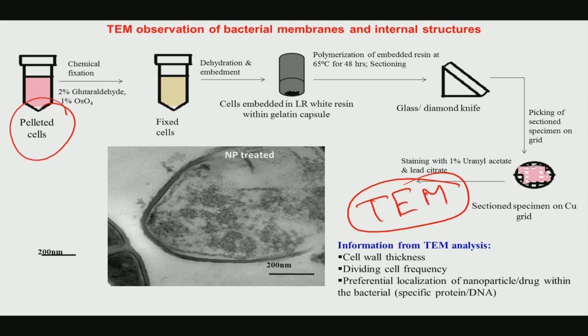So, what you do, you first grow the cells in a certain growth medium, and then you allow the bacteria to grow. One of the techniques in TEM sample preparation that one has to be careful about while using this biological sample is to use osmium tetroxide, OsO4, or glutaraldehyde. Now, the use of osmium tetroxide will give sufficient contrast in the electron micrograph of the cells or bacterial sample. In normal material science samples, one never uses this kind of additional supplement like osmium tetroxide while preparing the TEM sample. So, you need to know how to prepare these TEM samples before you can even go to the transmission electron microscope to see the ultrastructural features.